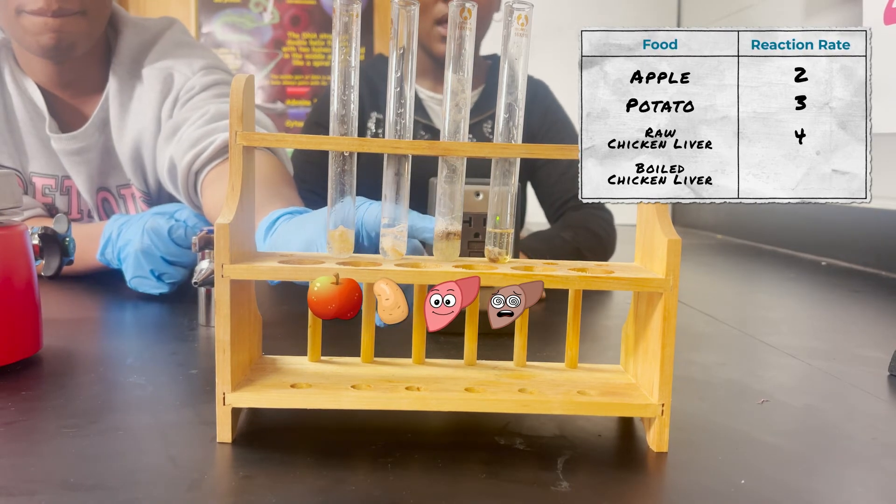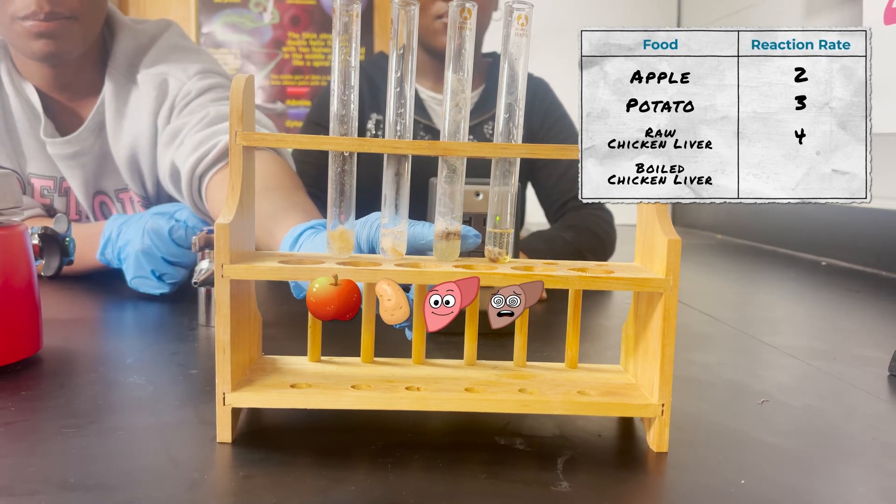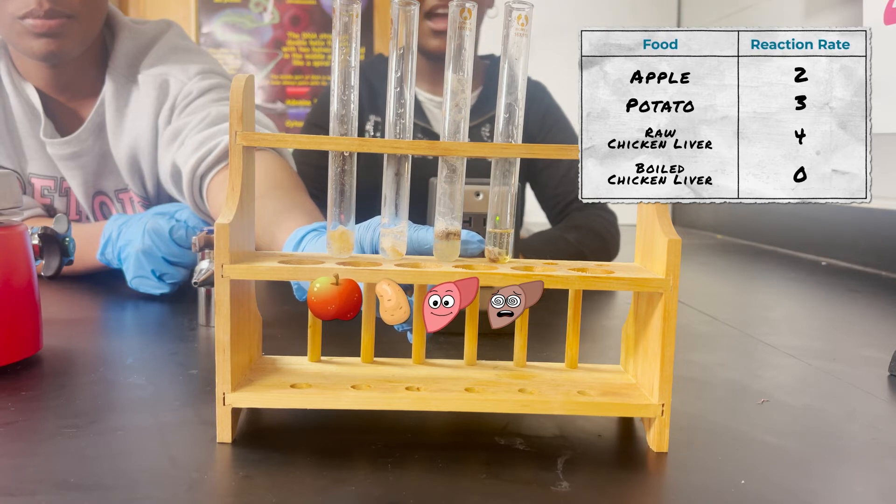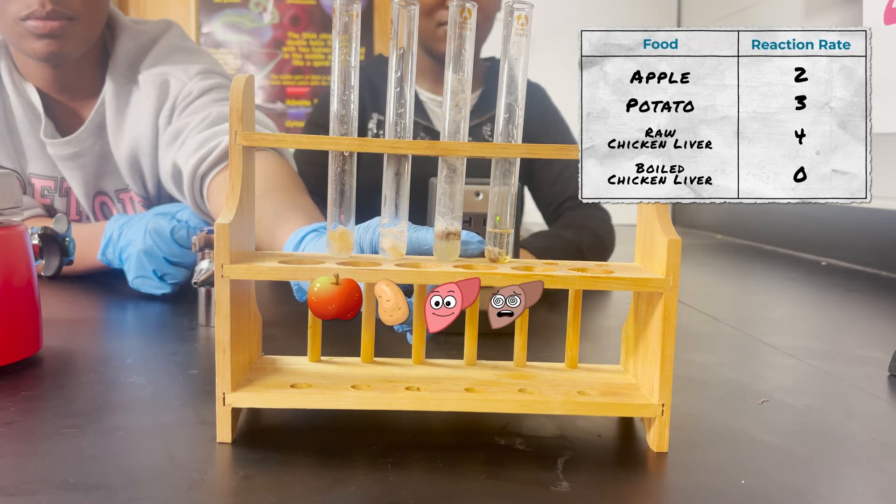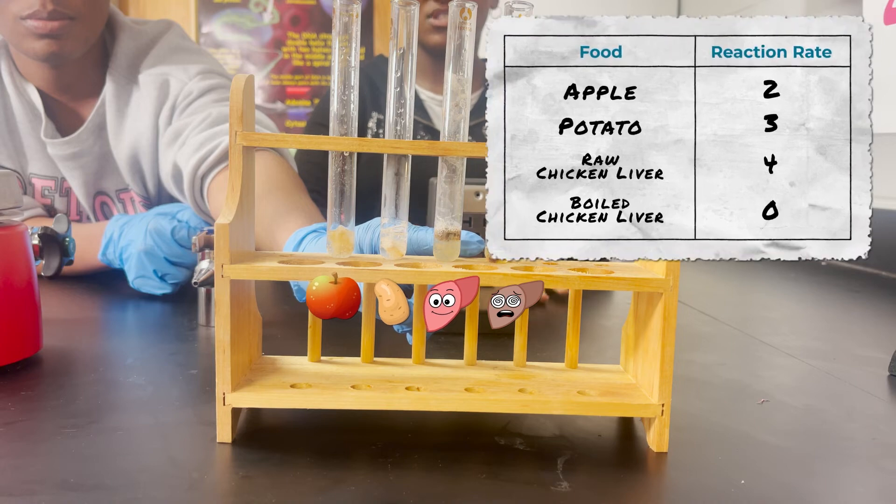The boiled liver's reaction rate was a 0 because it has no bubbles, no foam, and no reaction. When you boil a protein at a high temperature, it denatures and breaks down the enzyme.